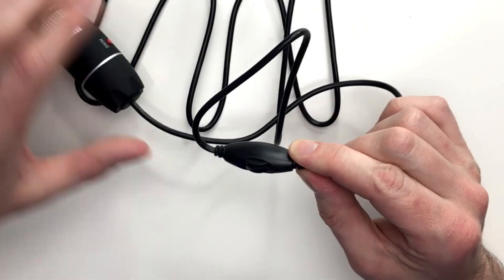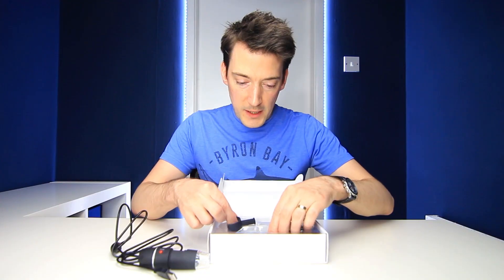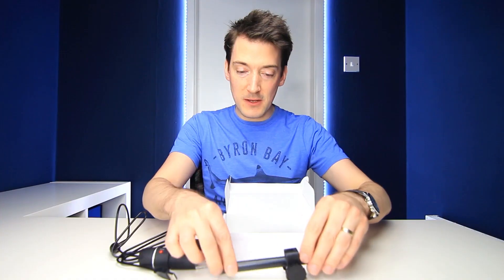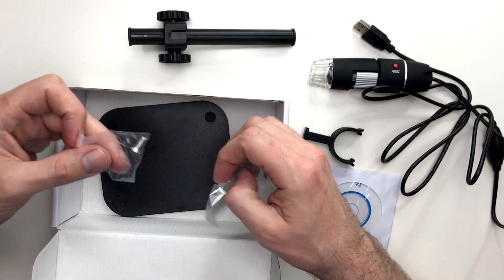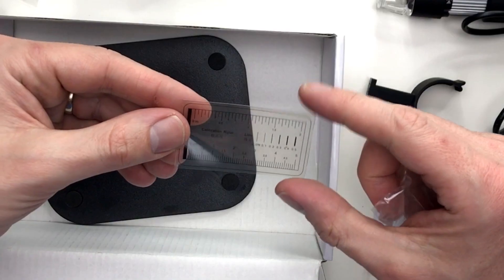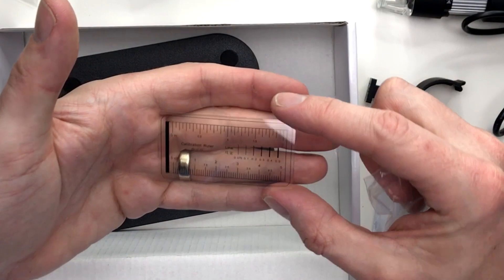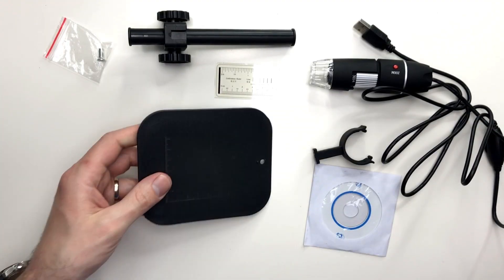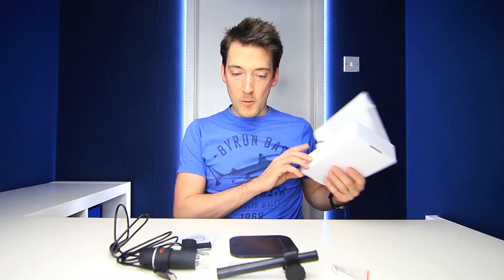And then we've got a little wheel here on the USB — I'm not too sure what that is yet. What else we've got in here — it looks like some sort of stand, that's how you use it up and down. There's a little CD-ROM, a little screw nut, and this is a little calibration ruler with measurements on it. And finally we've got the stand itself — so that will all attach together.